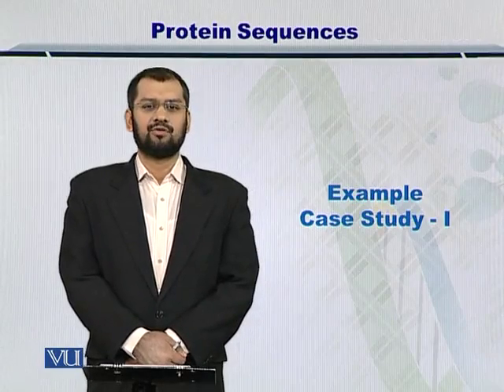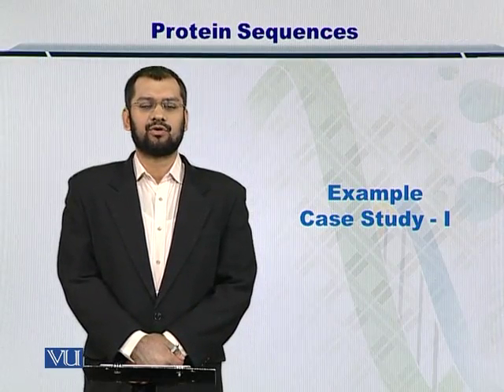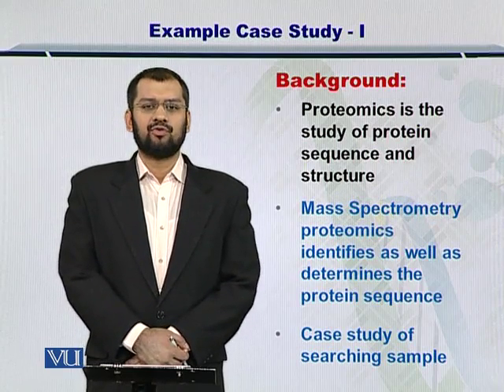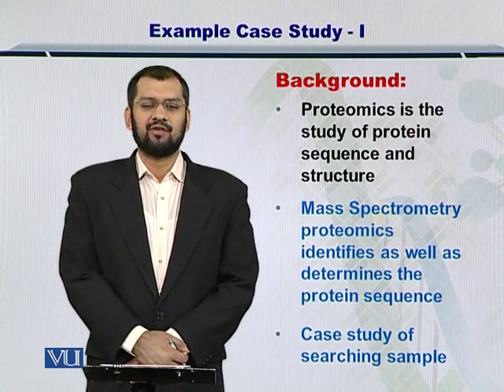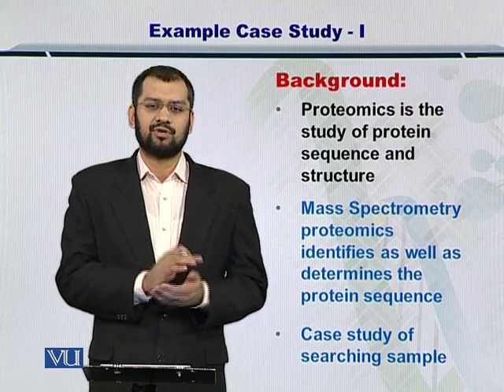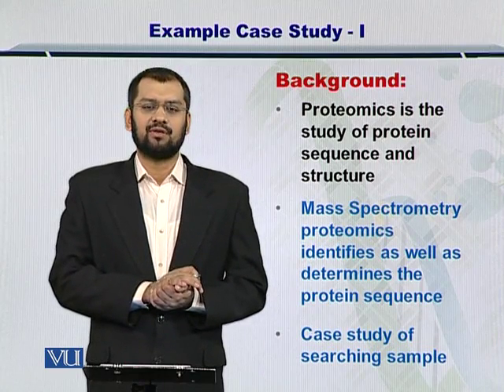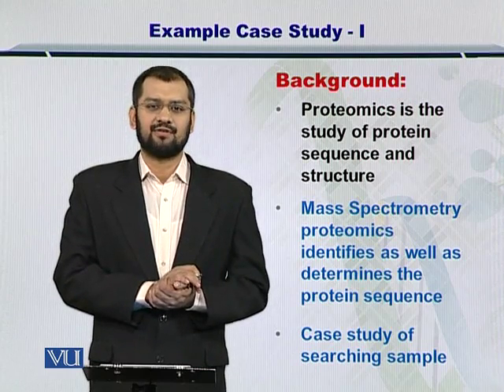Dear students, in this module we're going to start work on a step-by-step case study in order to better understand mass spectrometry-based proteomics. As you know, proteomics is the study of protein sequence and structure, and mass spectrometry-based proteomics helps you to identify and characterize proteins. So for that, you first have to perform the measurements on the intact protein, and then you have to fragment these proteins to look at the fragment masses.